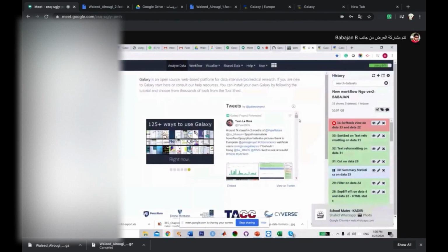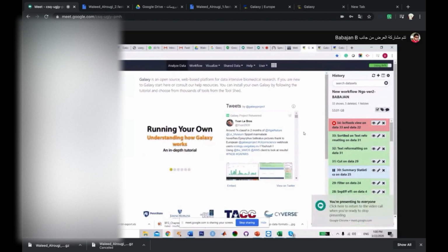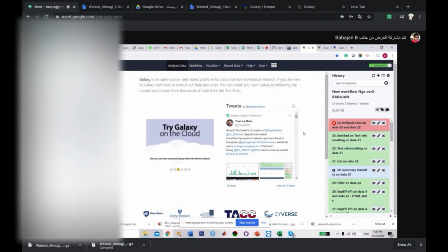The Galaxy. I think everyone registered for Galaxy. As I told you a few slides ago, in the last session, we need very high computational resources, high computational power, to work with this NGS data. Right now, whatever system we have, even the system I'm working on, is still not good for NGS analysis. We cannot even work with exome sequencing data.